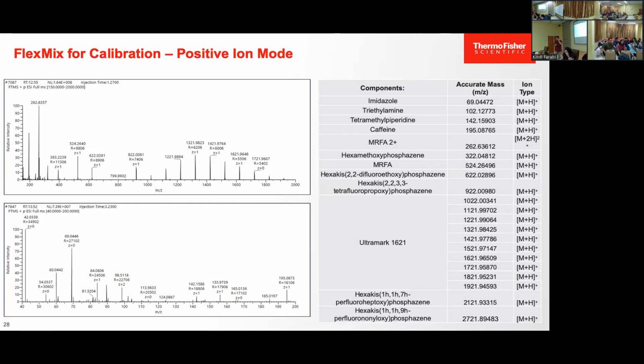I still remember about 10 years ago, I had a user in Singapore. He argued with me that the mass is wrong. How did he measure it? He used the molecular weight plus the mass of hydrogen. Then I told him that this is wrong because you need to add the mass of a proton, because hydrogen is not a positive mass. After subtracting the electron mass, the mass is correct. So it comes to this precision that you are able to detect.